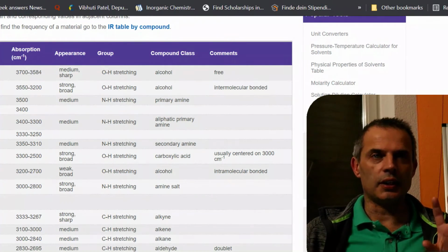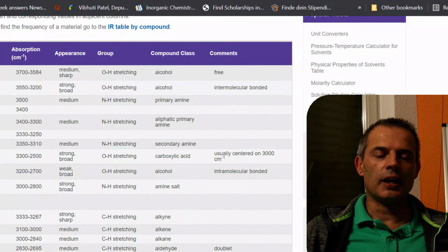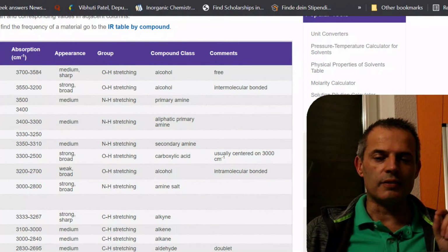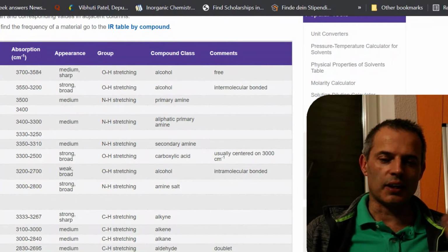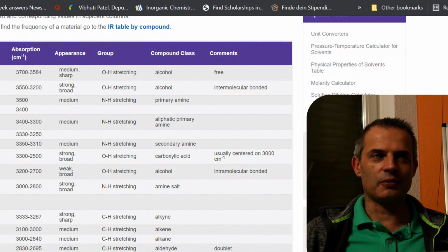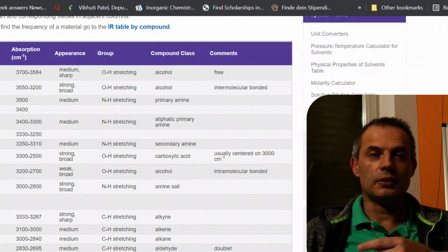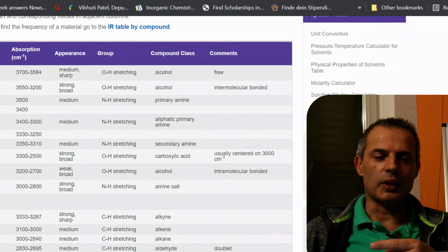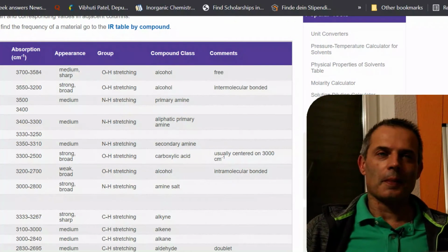Also traditionally in infrared, if you look at the scale, it will usually be backwards. So this 3700, which is the longest wave number, the shortest wavelength that you use, is typically on the left at the beginning of the scale, and it goes down to the right, but also because it's a reciprocal scale, the wavelength is getting bigger.